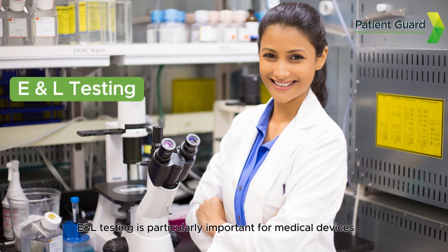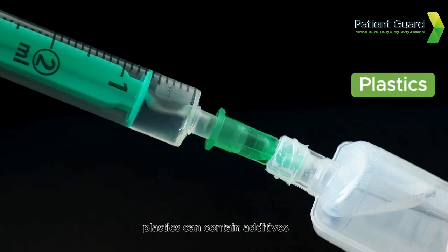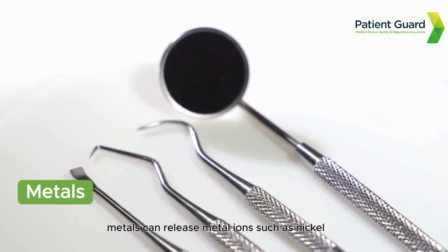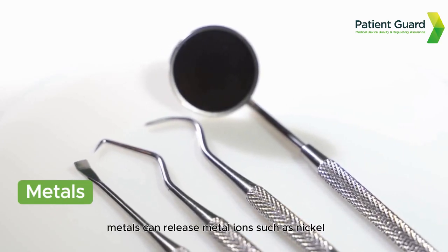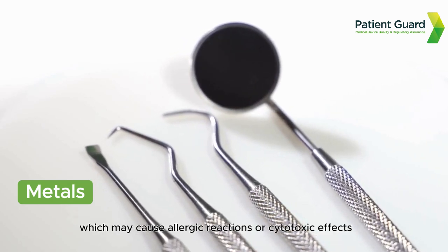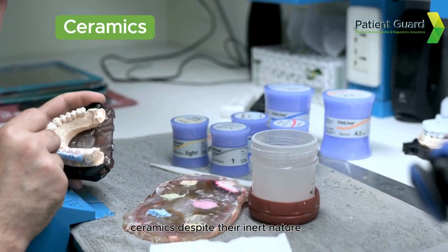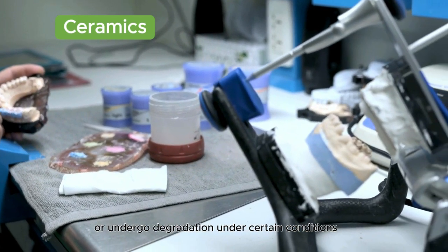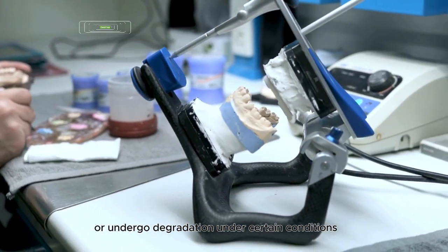E&L testing is particularly important for medical devices containing plastics, metals, and ceramics. Each of these materials can pose unique challenges in terms of chemical leaching. Plastics can contain additives and residual monomers that might leach out and cause toxicity. Metals can release metal ions such as nickel, chromium, and cobalt, which may cause allergic reactions or cytotoxic effects. Ceramics, despite their inert nature, can still release trace elements or undergo degradation under certain conditions.